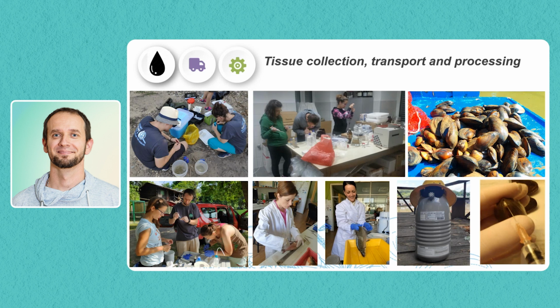If we are near the laboratory and can collect samples in the field and transport them in cool boxes to the laboratory in the next half hour, we do that. If we are able to prepare Comet Assay slides directly on the site using plates called gel bond, the slides will not fall off. You put them in the lysis and transport them that way to the laboratory. But if you are not close to home, quite often we are using liquid nitrogen for cryopreservation of the tissue. Then you can carry out the study later, as you already suggested.